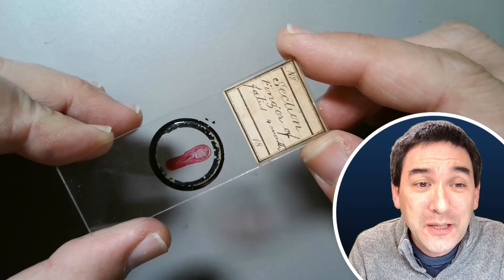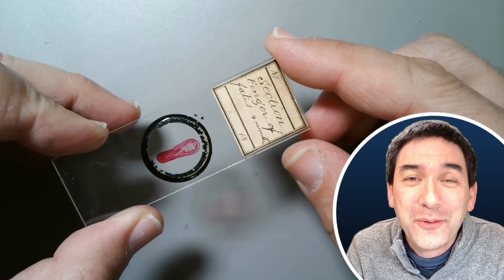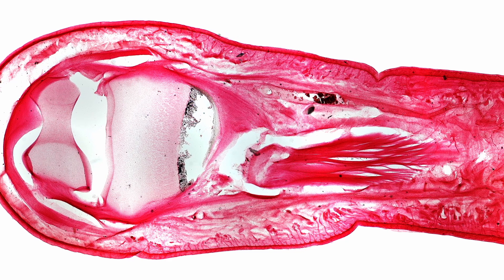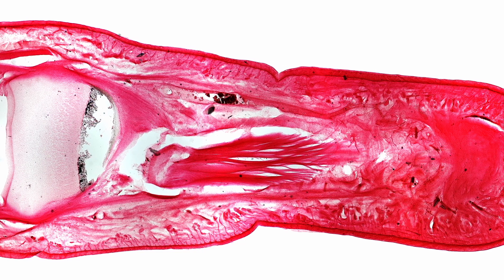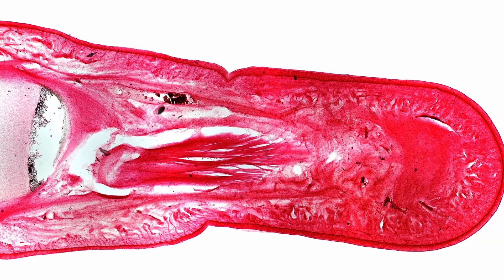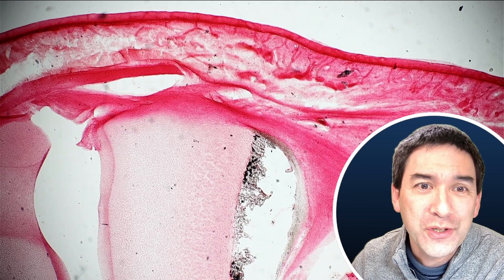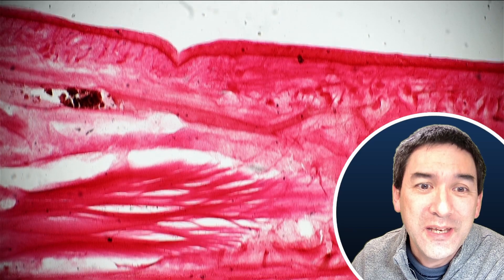What I'd like to do now is put this old antique microscope slide under the microscope. There are a few interesting parts I'd like to show you. In order to get a better overview, I took an image of the whole specimen and stitched it together, which already reveals quite a bit of structural detail. This is at low magnification using the four-times objective. It's a traditional histological slide — it's stained, though unfortunately I don't know which stain was used. We can already see a few structures, and I was able to identify a few of them.